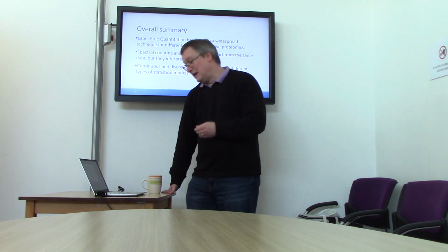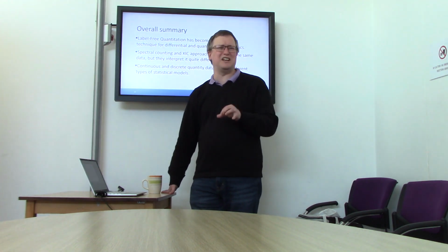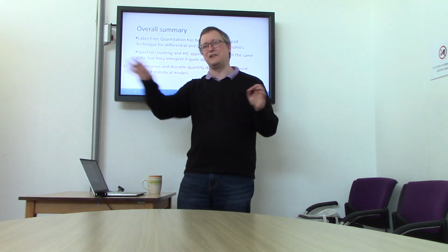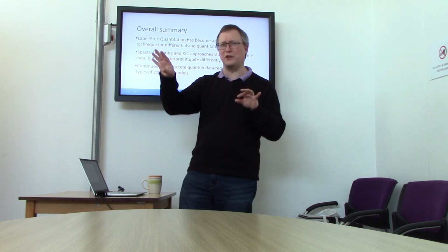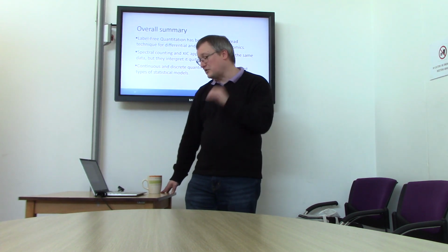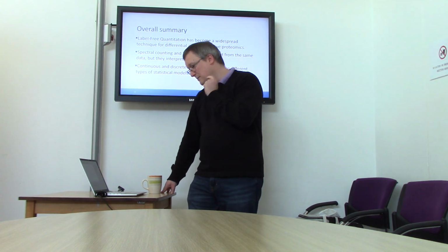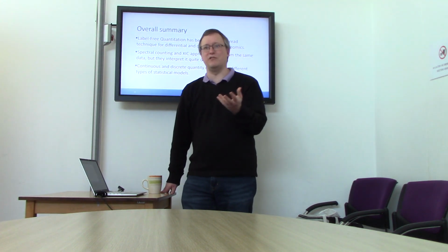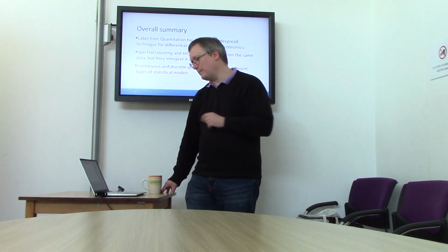All right, so label-free quantitation has become a widespread technique for differential and quantitative proteomics. I'm kind of hedging myself: to ask about what's different is a little different than saying by how much. So I'm kind of teasing those apart by calling it differential and quantitative proteomics. Spectral counting and extracted ion chromatograms start from exactly the same data. The same experiments can be interpreted both ways. But the way that we interpret those data, the way that we build protein ratios out of them, are completely different. So it's really worth understanding which of those two you're working with.